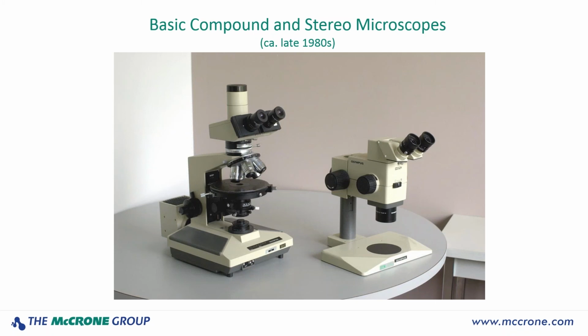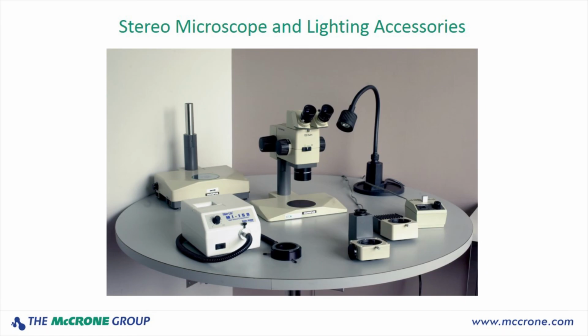These are just basic scopes, but as the curse starts to intensify, you want to add to it, and it's the lighting that you want to add. So here's what happened with the stereo microscope. We included some extra lighting. In the back left side is the stage, which has the transmitted light capability, which replaces the normal stage that's in the center. Then in the left-hand front, we have the ring light.